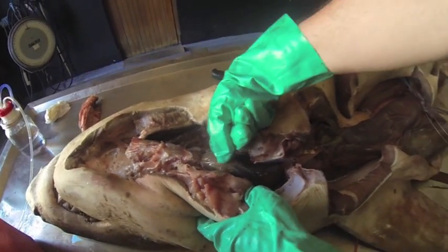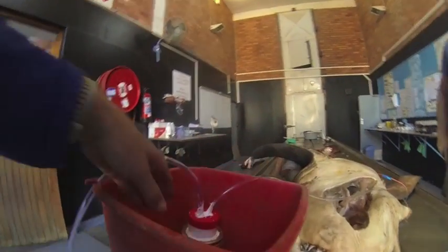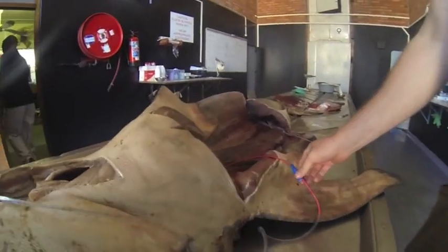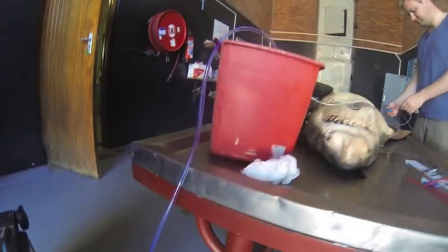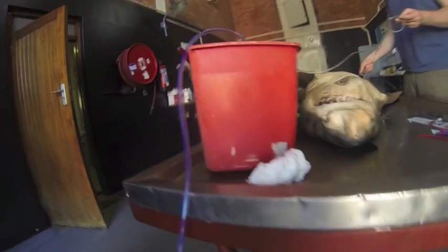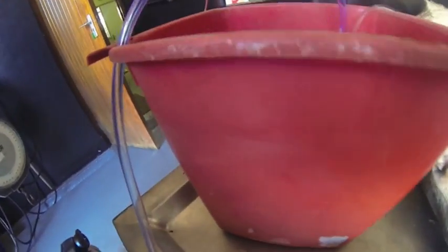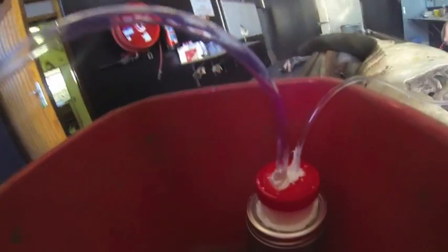A pump was produced to inject the liquid latex in this specimen, and we are going to start. It's blowing because it's not going — there's some obstruction outside. Yeah, definitely.